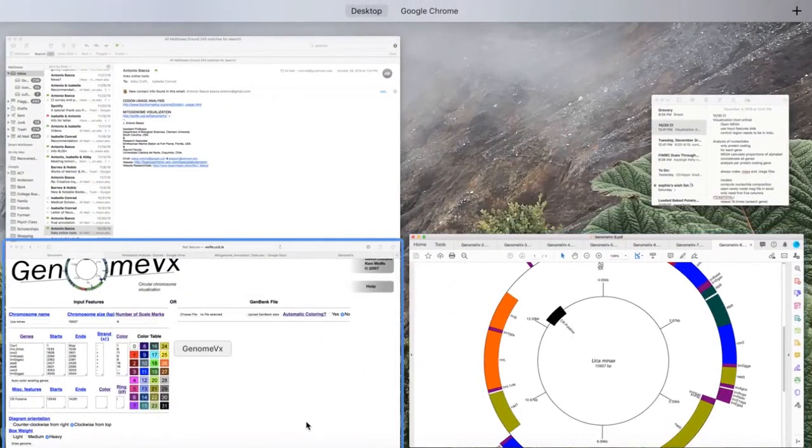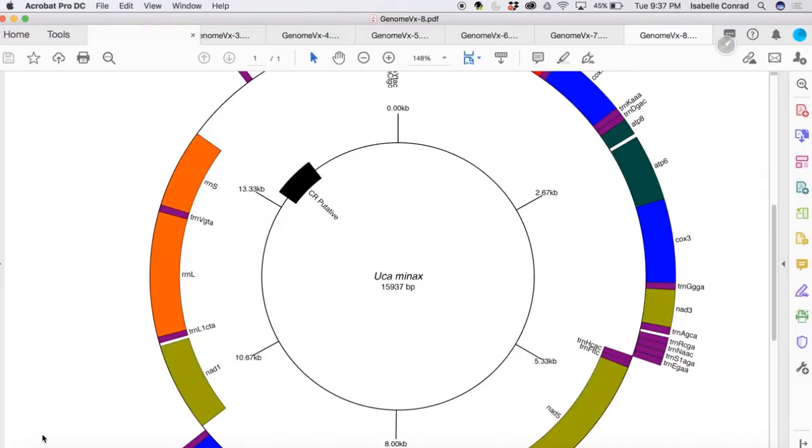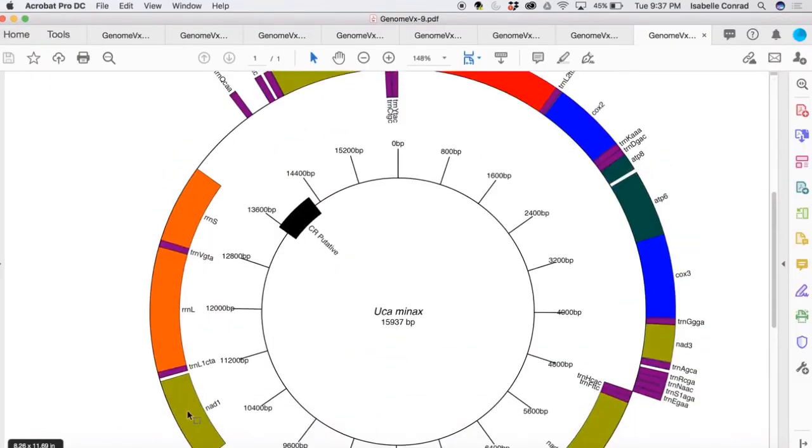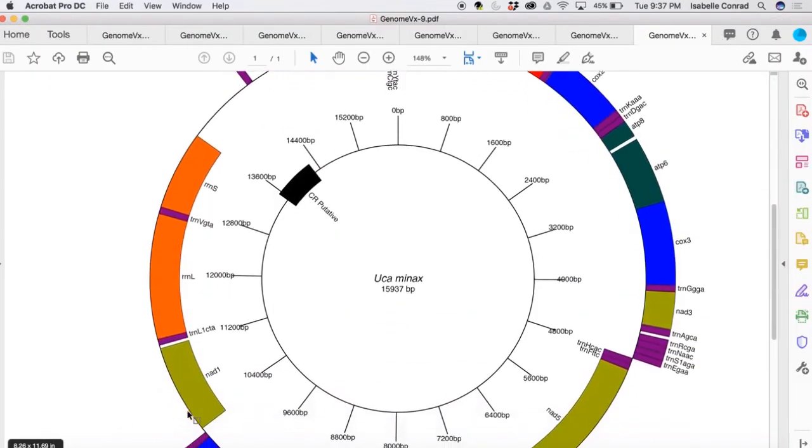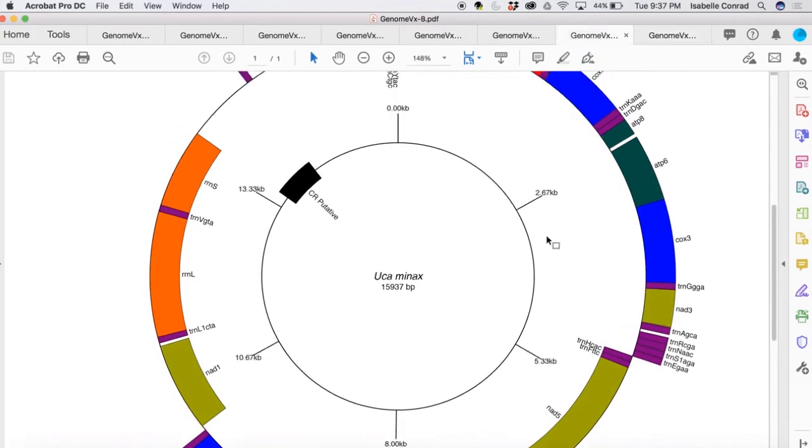So we can also choose the colors for the genes ourselves instead of auto coloring. And then we can change the number of scale marks. So scale marks just measure the length of the gene. So instead of six, we did 20. And so there's 20 versus six, what we had before.